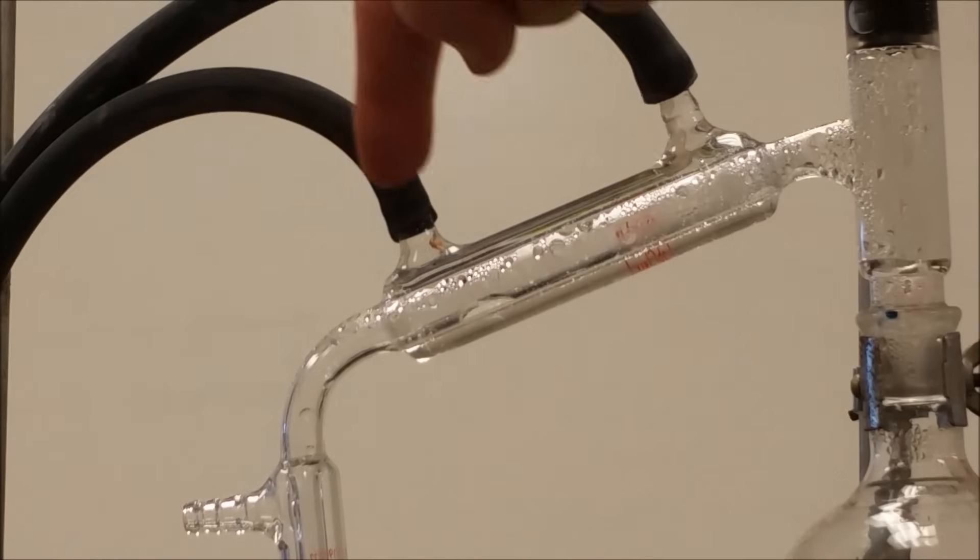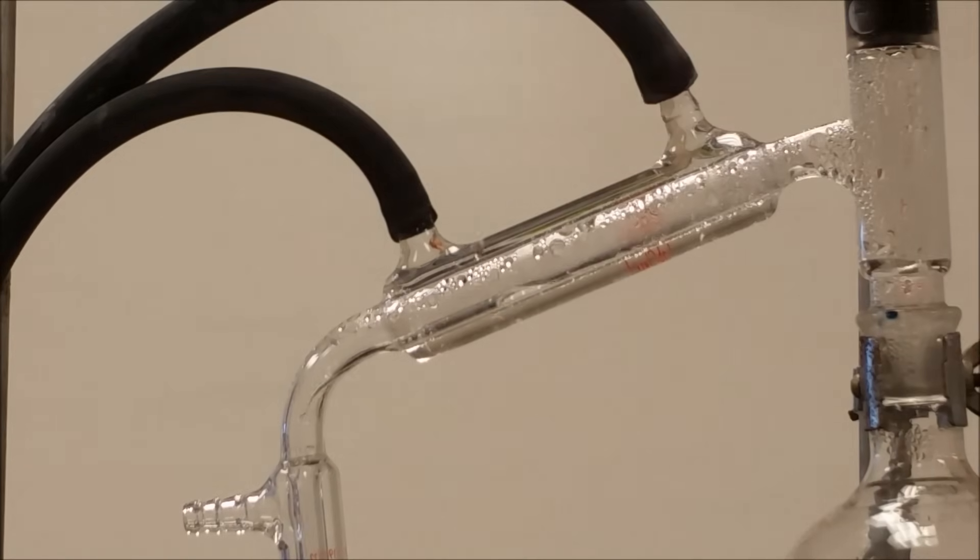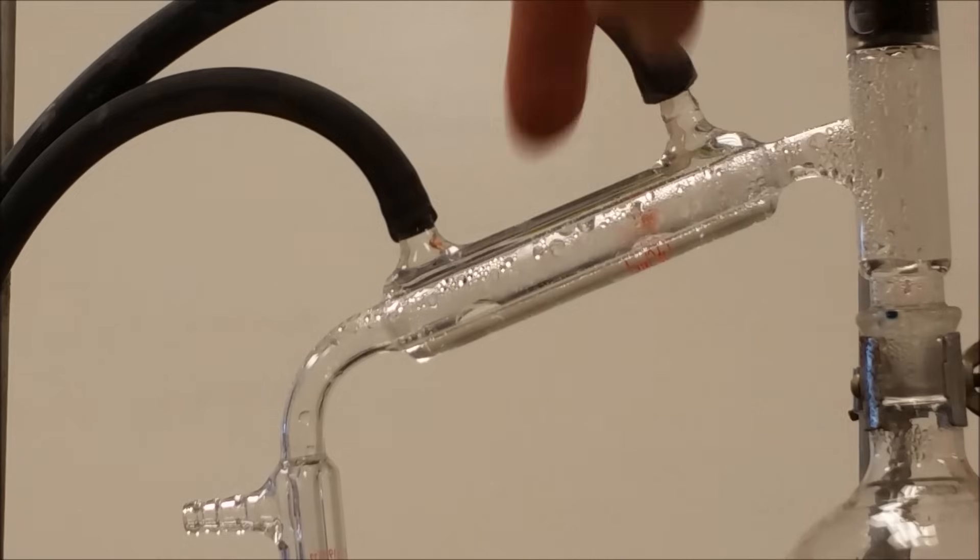So if that's not clear, the water is coming in through here and running outside, and there's an outer tube and an inner tube.